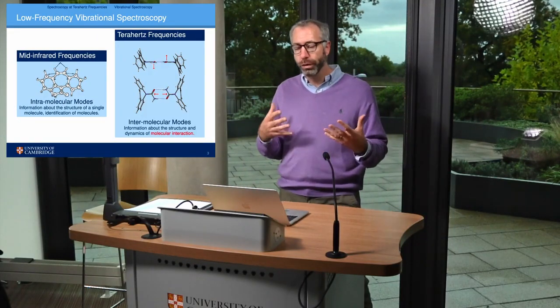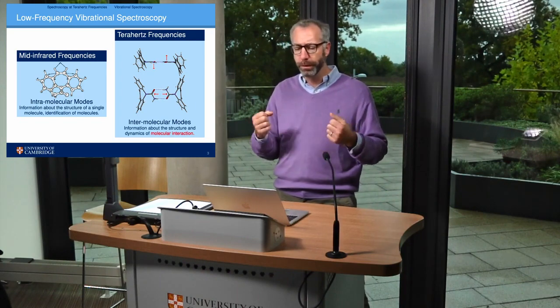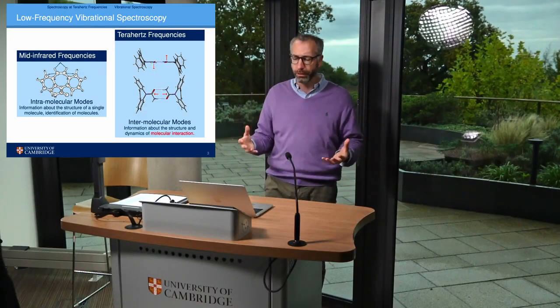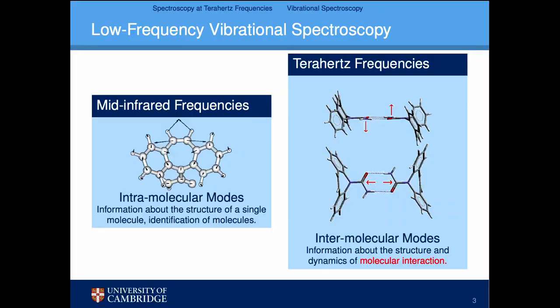Now, compared to Raman or infrared spectroscopy, where we almost exclusively measure the vibration of individual atoms or small groups of atoms relative to one another, at the lower frequencies in the terahertz range, the radiation excites motions of entire molecules, or at least large parts of them, which are governed by much weaker forces compared to the covalent forces at infrared frequencies.